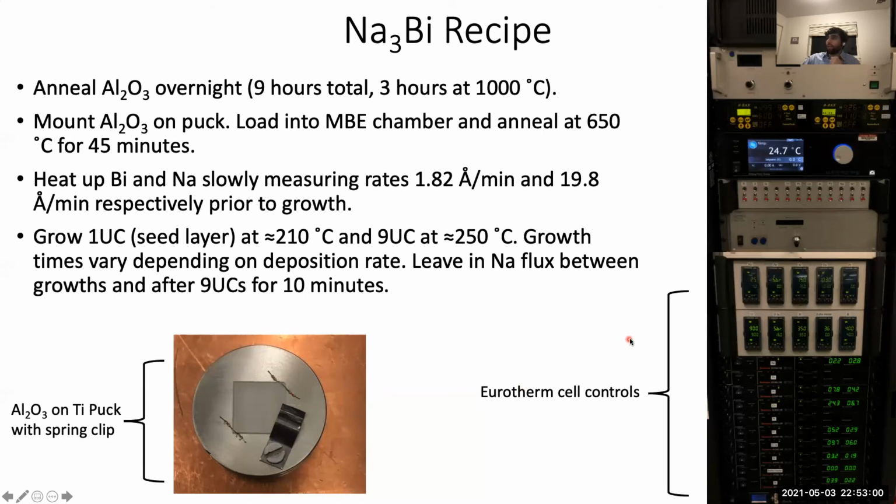On the side over here, you can see essentially all the MBE controls. And of particular interest are these Eurotherm cell controls, which control the temperatures at which the materials sit in the crucibles in the MBE chamber.